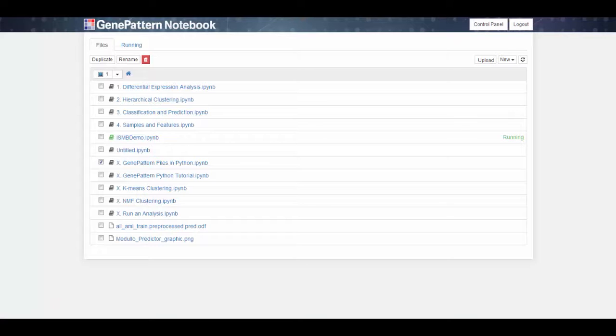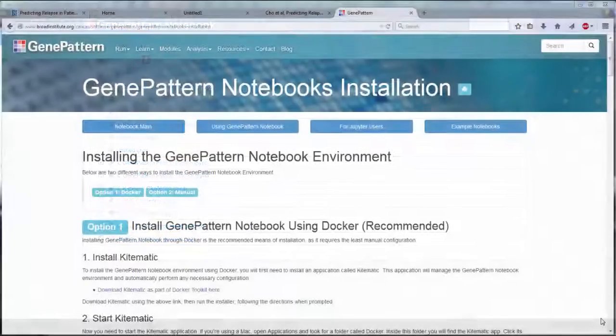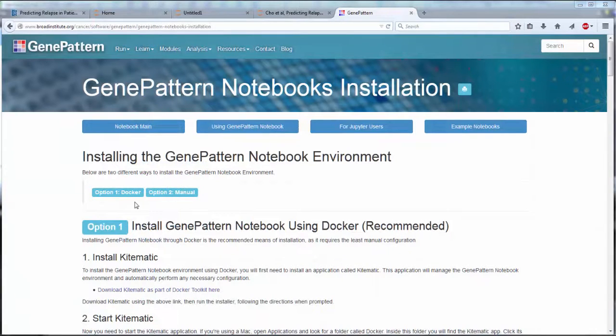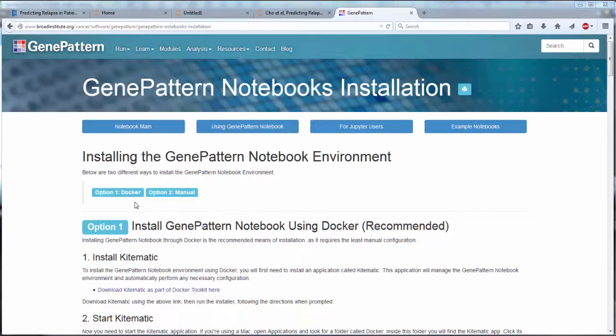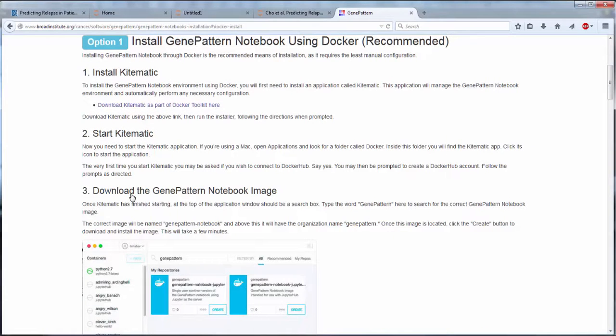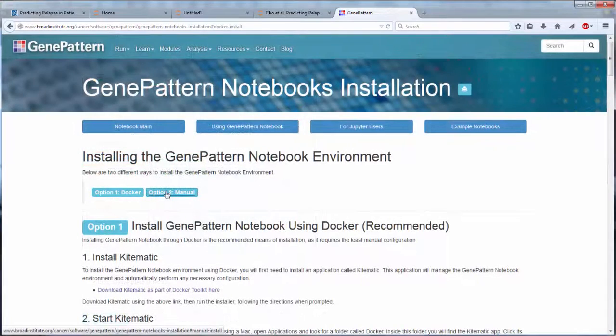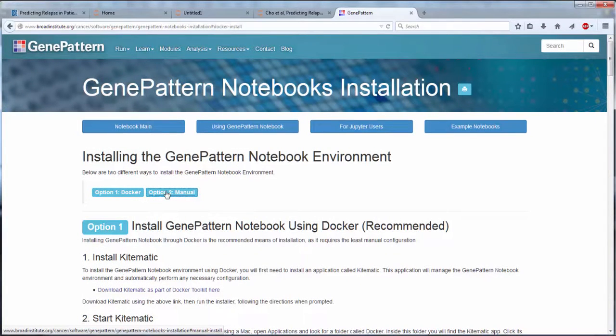For those who want to run GenePattern notebooks locally, we provide two methods for installation. If you are looking for a complete off-the-shelf installation, we provide a Docker image that can be run using the KiteMatic application. This requires the least amount of manual configuration. Those who prefer the manual approach can install the GenePattern notebook extension via the PIP or Conda package management systems.